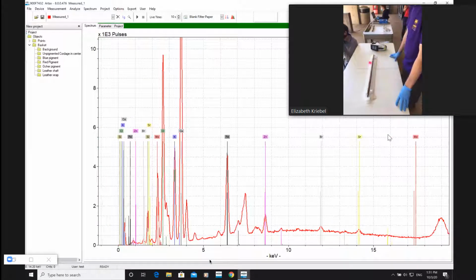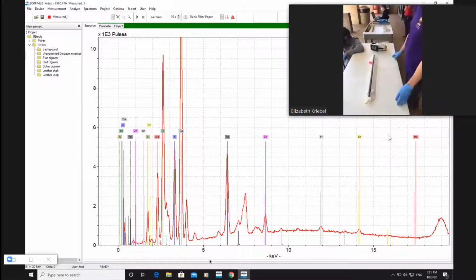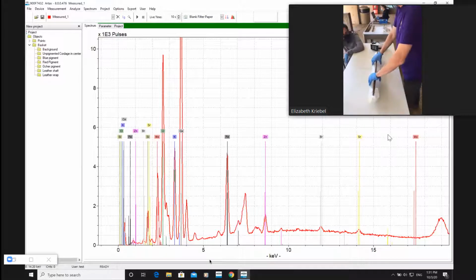Yeah, it is. Well, so the sulfur, I think there's some kind of animal fat that's been rubbed into this as a preservative or something, because the sulfur doesn't make any sense for a wooden object. It does have some markings like it's been wet before, something that's got wet and then dried. And then a lot of chlorine and a little bit of bromine as well. So my guess would be salt wash based on the high quantity of chlorine. Something so simple and yet so complicated. That one was much busier than I would have guessed.